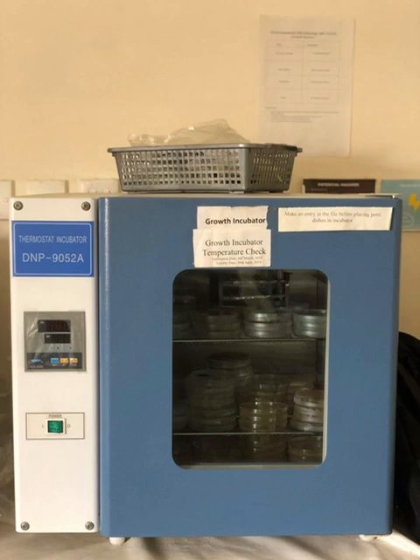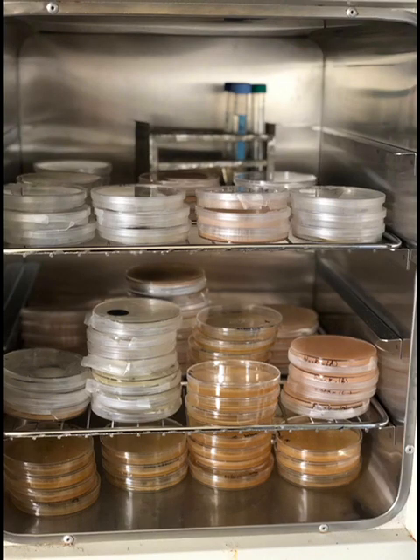Set point variable is the target value or desired condition that the system aims to achieve and maintain. In a growth incubator, the SV would be the preset temperature, humidity level, or gas concentration that the user specifies as optimal for the growth of the particular microorganisms or cell being cultured. Petri dishes are placed in a growth incubator to provide a controlled environment that promotes the optimal growth and development of microorganisms or cell cultures.